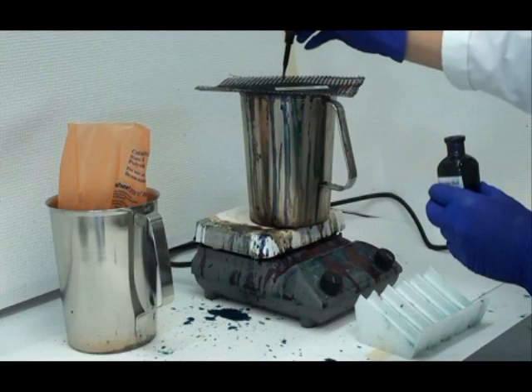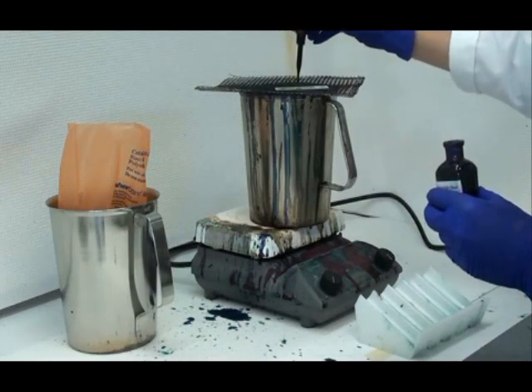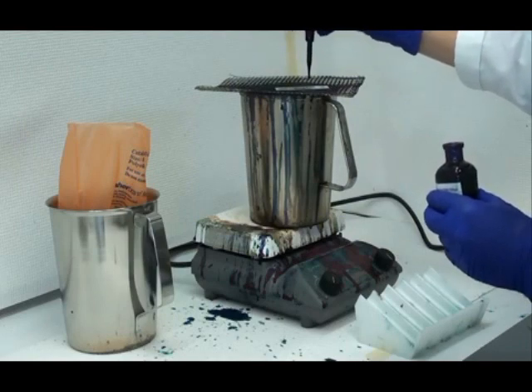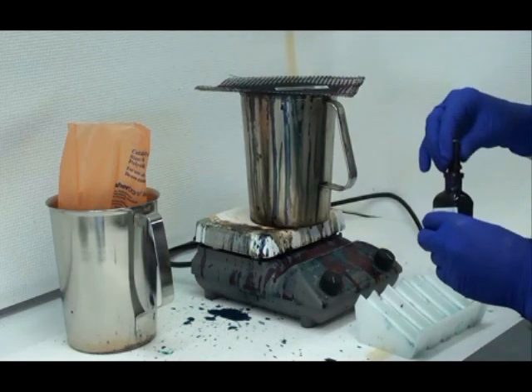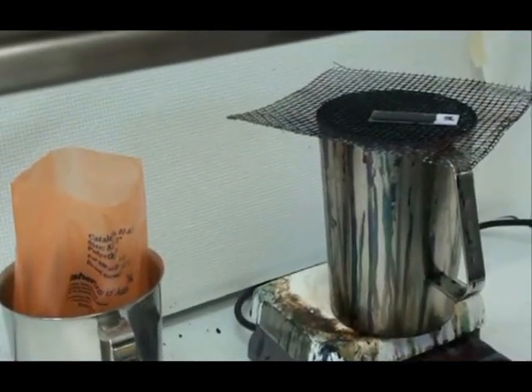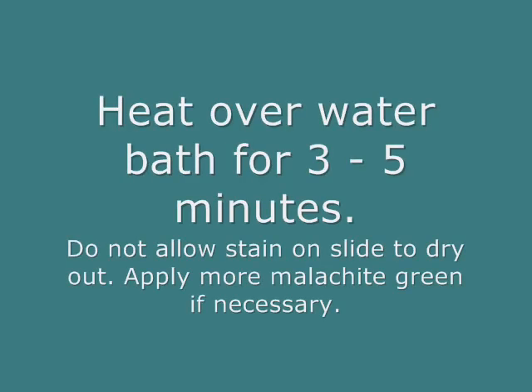I drip the malachite green directly onto my slide, making sure that each of those circles are completely covered with stain. I allow the stained slide to heat over the water bath for three to five minutes. It's important not to let that stain dry out, so if it looks like it's beginning to dry out you can apply more malachite green.